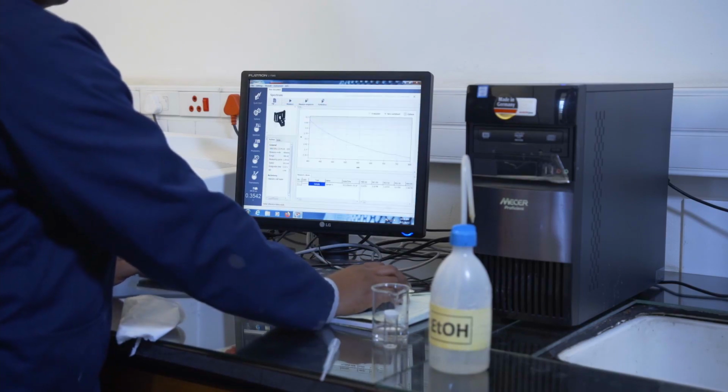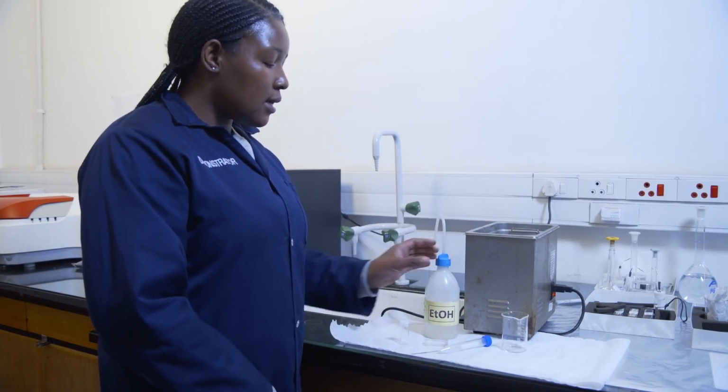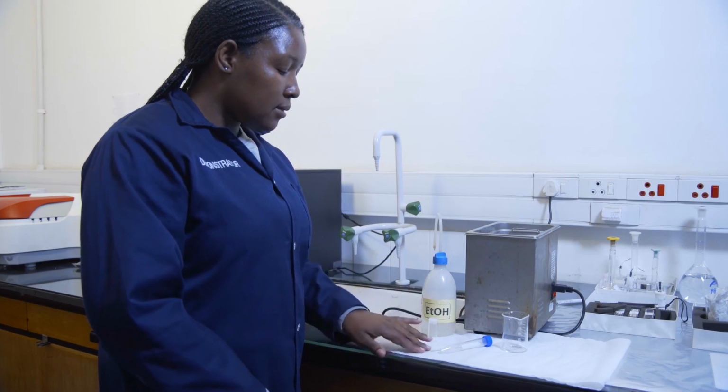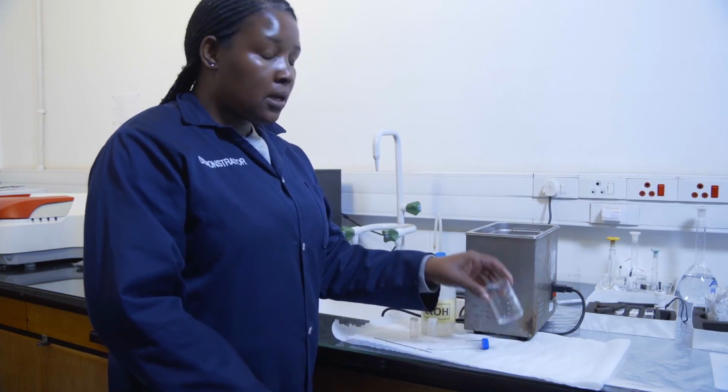And then Save. In this part of the experiment, the PL spectrum of our zinc oxide nanoparticles in ethanol will be determined using a PL spectrophotometer. For our sample preparation, we are going to need a sonicator, absolute ethanol, a cuvette, a vial, a spatula, our zinc oxide, as well as a beaker.